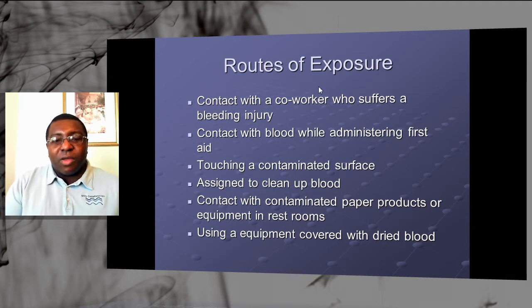Contact with blood while administering first aid, that's a way of exposure. Touching a contaminated surface, that's why it's very important to clean up the lab and keep it clean. If you are assigned to clean up blood, make sure you protect yourself.